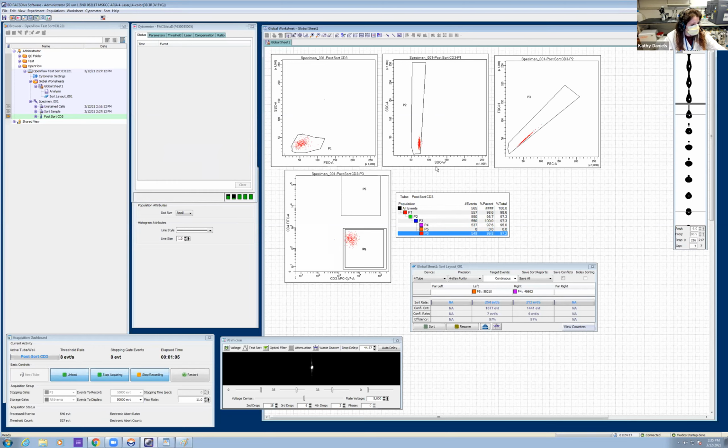If we'd like to check the other population, I would have to do another cleaning, since I'm technically running another sample through the instrument. But what we can see again is that our purity is looking really on par with what we'd expect from the sort that we carried out today. So we would expect the other population to be pretty similar. And as you said, we probably don't want to do that because we'd have to clean it.